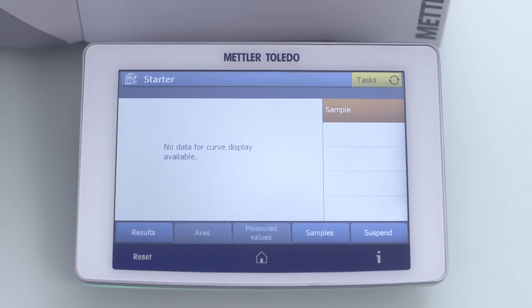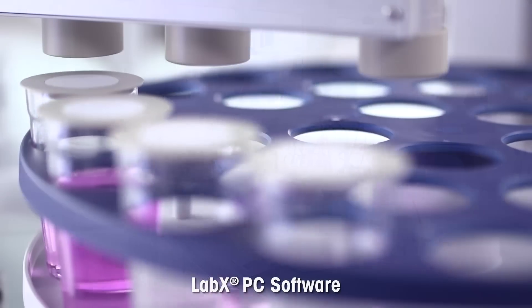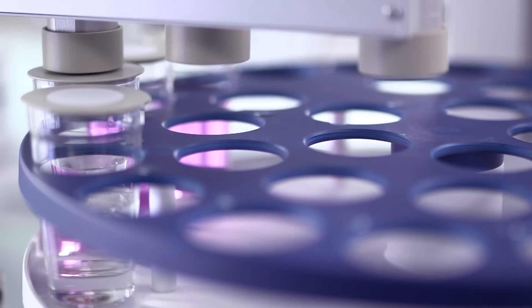Dual mode allows work to be performed from the touchscreen terminal or from a LabX PC, or both depending on the environment and user needs.